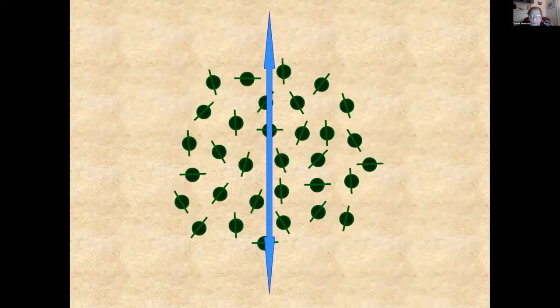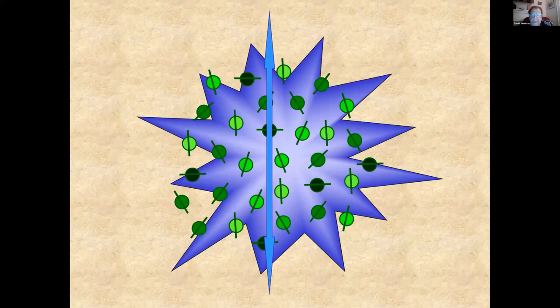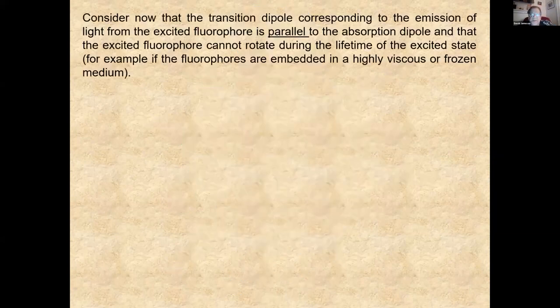And we'll try to show that with a little illustration. We excite with parallel light, and we can see molecules with the dipole, those are the lines through the circles, lined up are brighter. The ones at a slight angle are dimmer. They're not as probable to absorb. And the ones at a large angle, we don't see them at all. So that's the idea of photoselection.